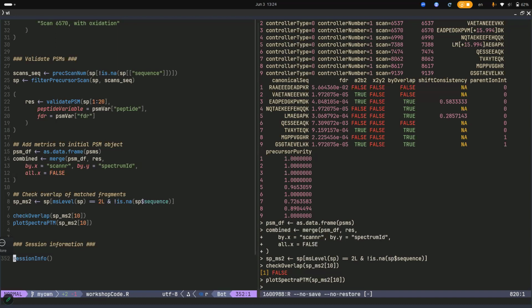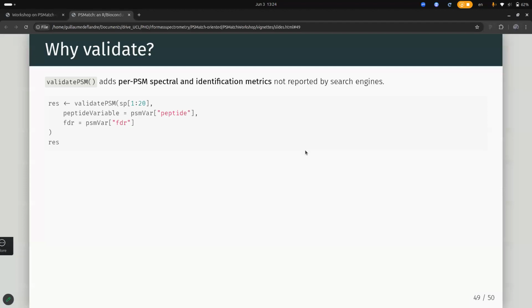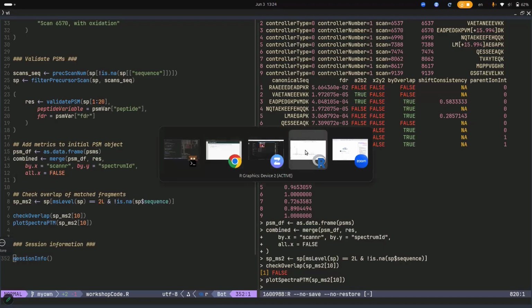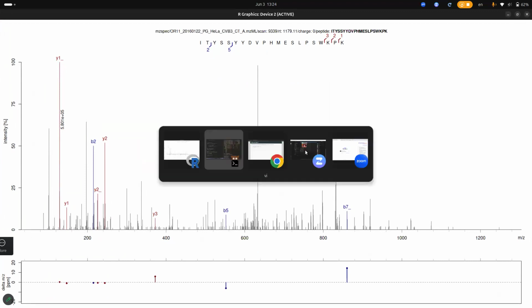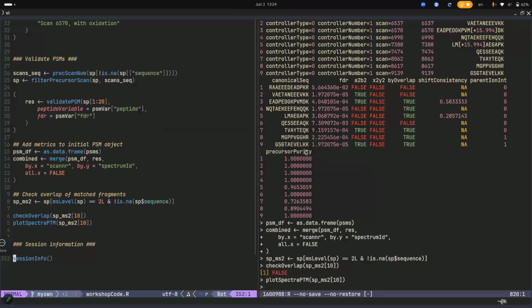No, phosphor is a name given by the Unimod. You could, and I mentioned phosphor, but I have absolutely no clue if that would actually be helpful. I think serines, right?